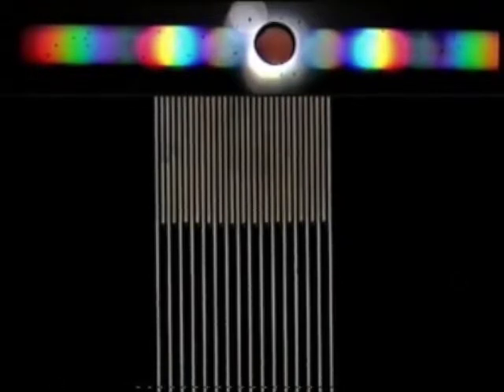The notion is that the zero order light lights up the background. We know that if we withdraw the stop and take the specimen away, you see that the zero order gives you a uniformly illuminated background.